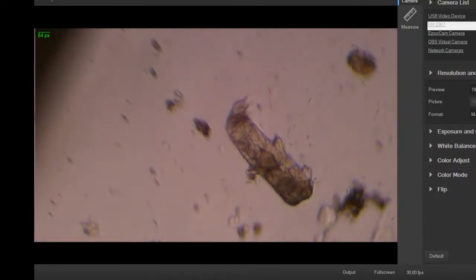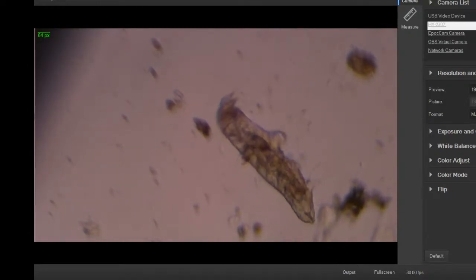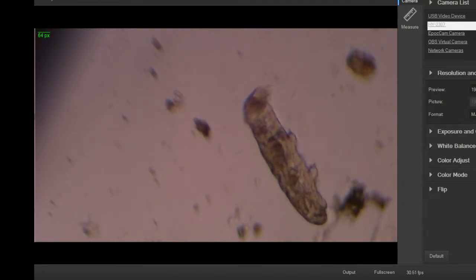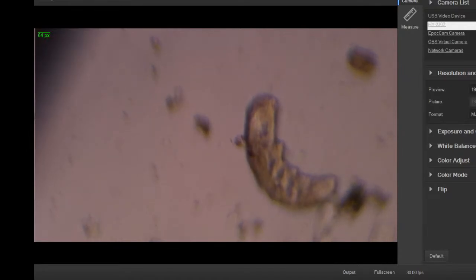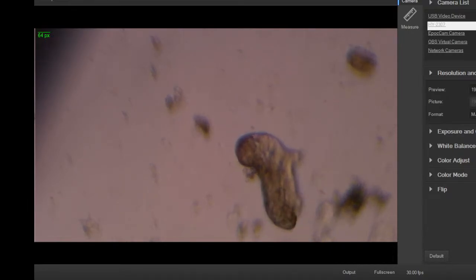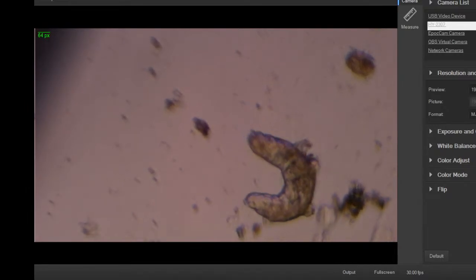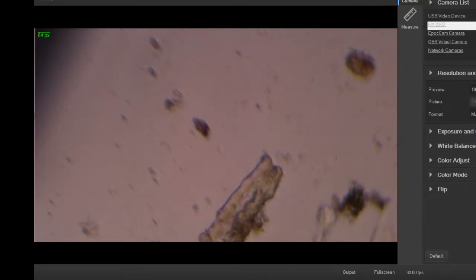Better view of it there. There you go. Sorry, it's hard not to move the table. It's in a pool of water, so he's going to wiggle a bunch, but this view is nice because it can swim much more than it can on a slide. So you see more what they act like when they're just kind of hovering in water versus confined to a narrow field of view of a slide. So this is more natural movement when they're in water.